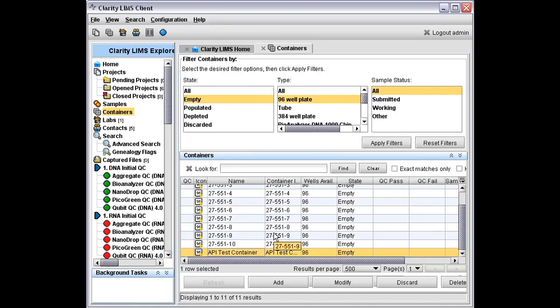As I've said before and elsewhere, we'd largely be doing these kind of interactions via a script, but for one-off things don't forget that you can use the browser plugin Poster and save yourself the overhead of writing a script to do essentially a simple one-off operation.